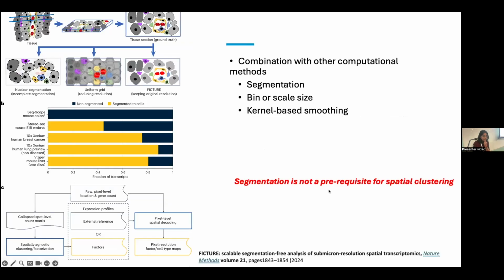So before that, I just want to go through this step by step. So for segmentation, we're talking about Visium HD here. Visium HD is not single cell. It is single spot. It's subcellular spots. Basically you have tissue over this grid, and each grid bin extracts a set of counts from that region within that 2 micron by 2 micron. It's not single cell. It can be part of a cell. It can be boundaries between two cells.